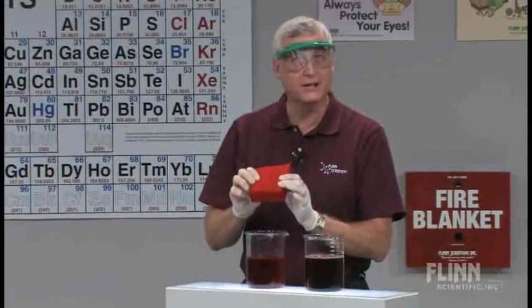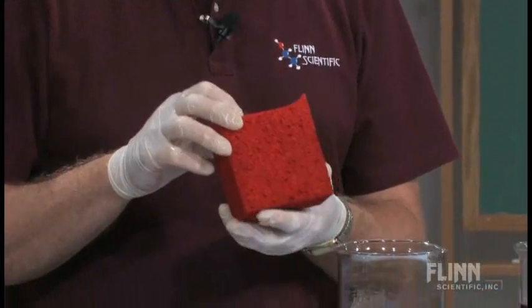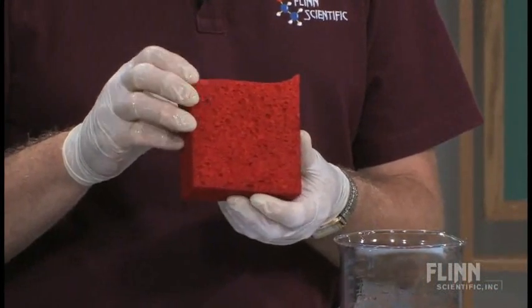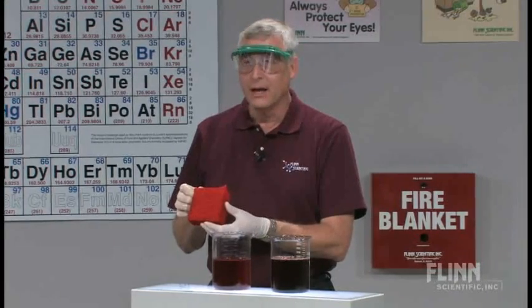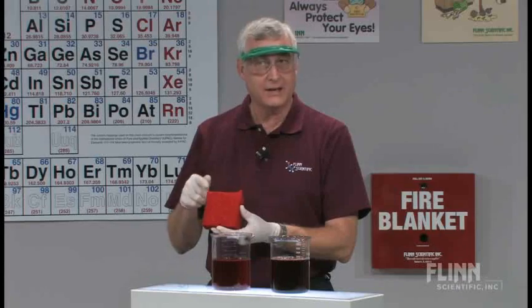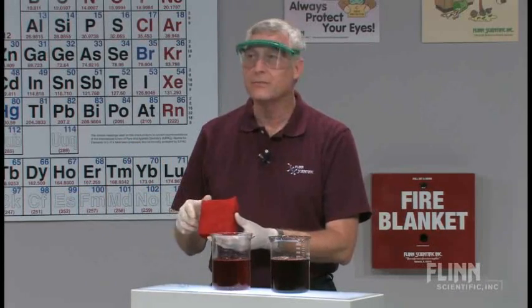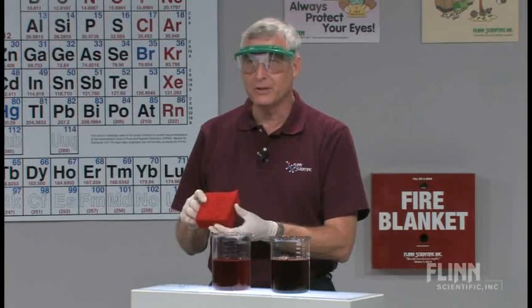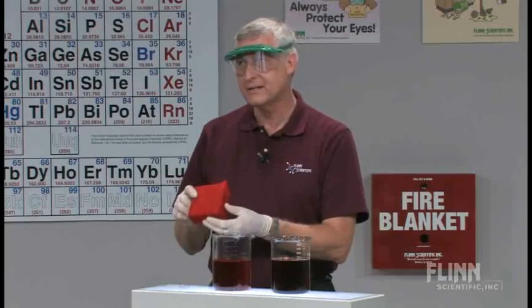The sponge is a cellulose sponge, and it's been soaked in a biological stain called Congo red. The Congo red is not only a biological stain, but it's also an acid-base indicator. And while we typically tend to think of acids as being in the red region and bases being in the blue region, kind of like litmus, Congo red is actually the flip of that. Congo red happens to be red in base solution and blue in acid solution.